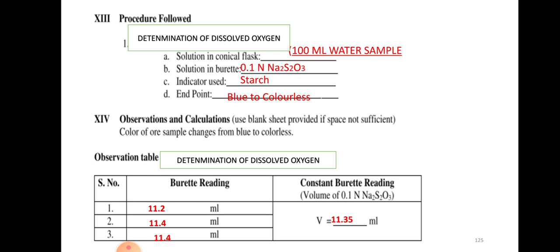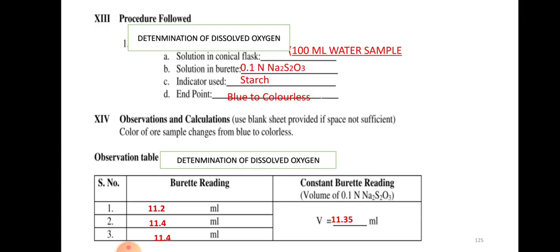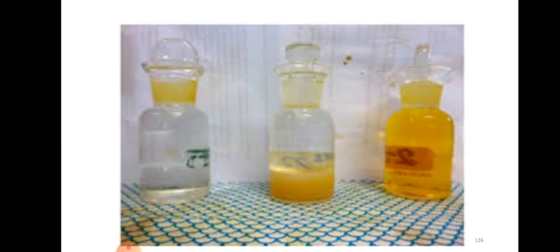This is called the procedure. And whatever the reading we are getting when the color changes blue to colorless we are going to note down. I am considering 3 readings and we are going to take an average as a constant burette reading. See, initially when we are taking a water sample, when we are adding manganese sulfate and alkaline azide, it is going to form a precipitate. And when we are going to add H2SO4, solution becomes clear. We are going to keep for 15 minutes and this solution we are using for the titration.